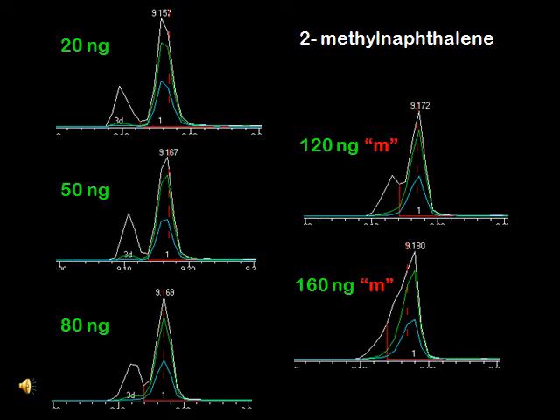The manual integration of the 120 nanogram standard was appropriately performed by dropping a perpendicular integration from the valley between the peaks.